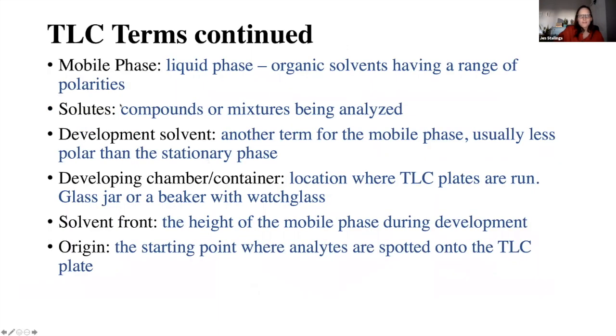Another important term is the mobile phase. Mobile is moving, and there's some type of movement happening. That's your liquid phase. It's going to be a type of solvent that you're putting into your TLC setup, and it's going to move. It's not stationary. This is the mobile phase.